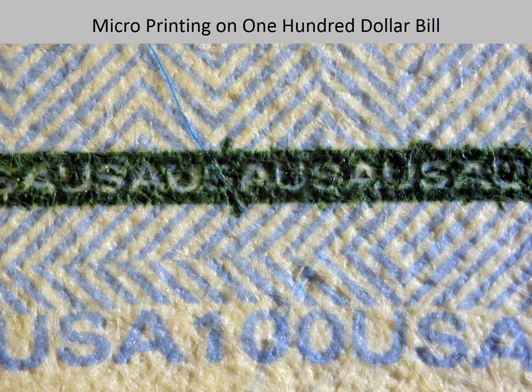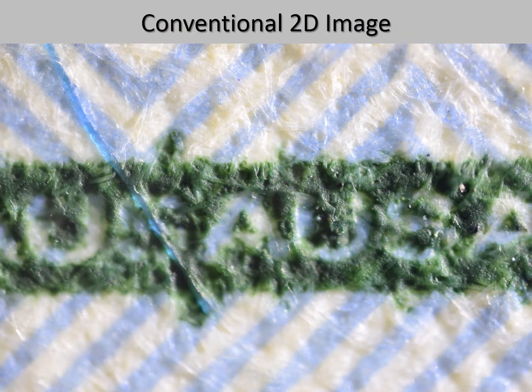Here is an image of the microprinting on the end of a $100 bill that says USA, USA, USA. Here is a closer 2D image of the microprinting, and you can see that only a portion of the image is in focus.